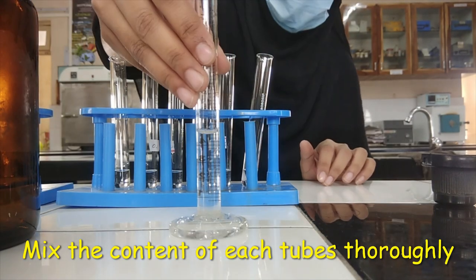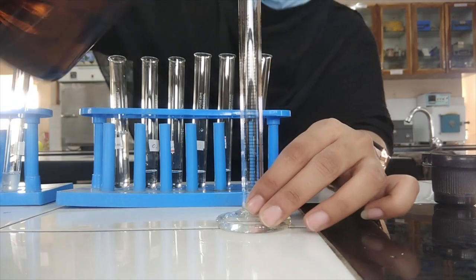Add 5 ml of reagent C in each test tube and mix the content thoroughly.